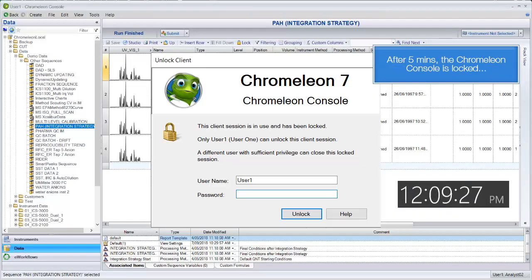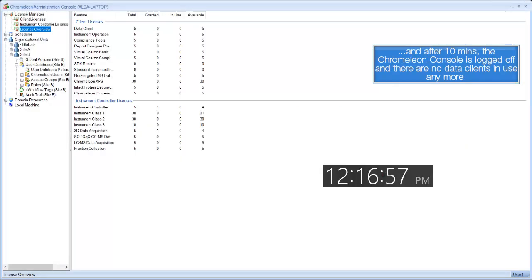After 5 minutes, the Chromeleon console is locked. And after 10 minutes, the Chromeleon console is logged off, and there are no data clients in use anymore.